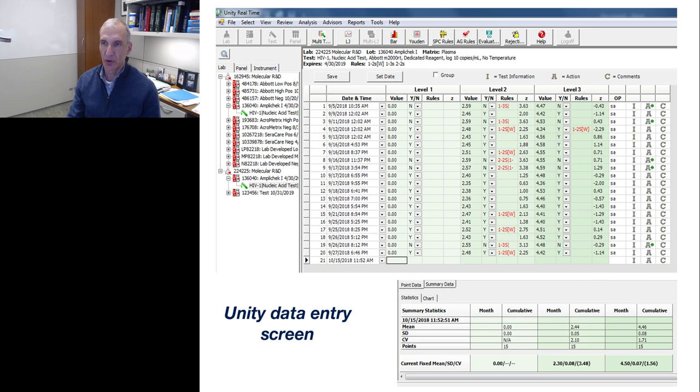And then we can put in the values, and as soon as you enter the values, those rules are applied to it, and you can see there are lots of red where there were failures or values out of range. I showed this only because I wanted to use it as an example to show how the flags are generated, but the data really wasn't that bad. We just made a mistake when we entered the expected ranges.